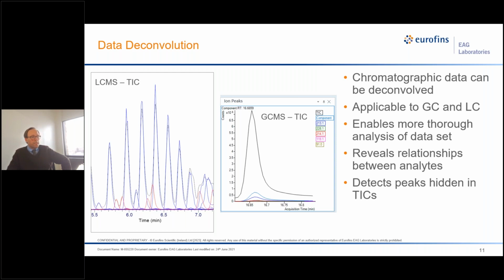but because of the relationship between those ion masses and the retention times, we can be certain, or at least fairly confident, that these things are actually all associated with the same feature. And this is important because if we don't process this data and make sure that we assign these multiple signals to the one compound coming out, we may have false positives.